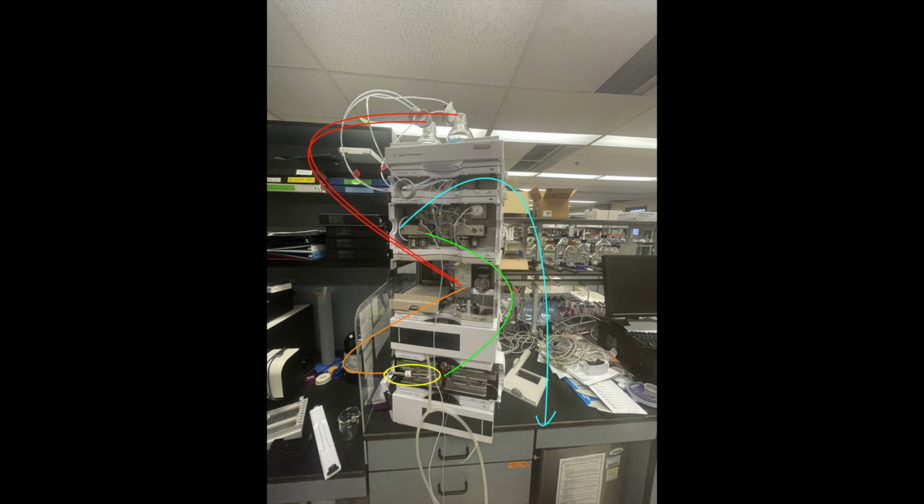And so what you do is, in this image, when this peptide falls off the column, it goes in the green towards that structure over there, the lamp, which is shining a very specific wavelength of light on all of the passing solution. Something to note about amino acids is that they absorb light at very specific frequencies. So you're looking at all this wastewater that's coming off the column, and you're trying to see when you have absorbance in light frequencies that are, I guess, relevant to peptides. And that's how you can tell when something comes off the column.